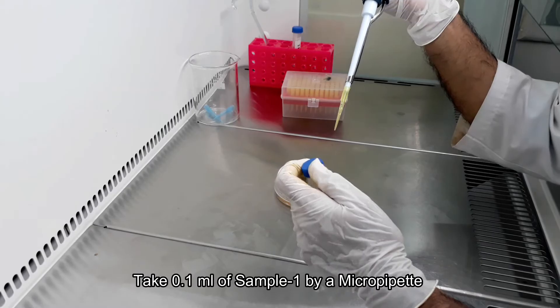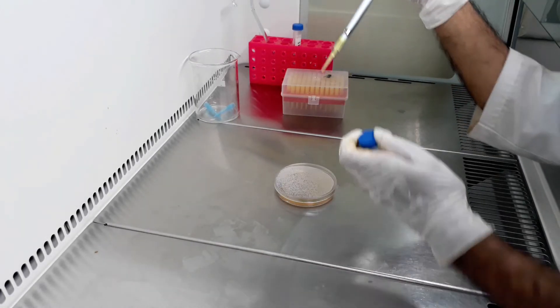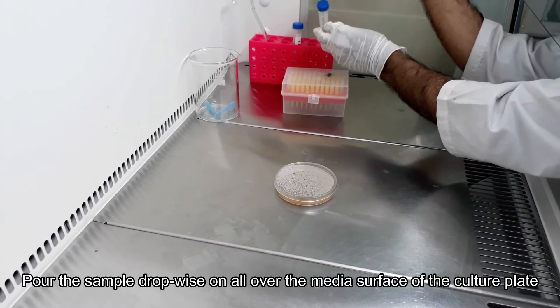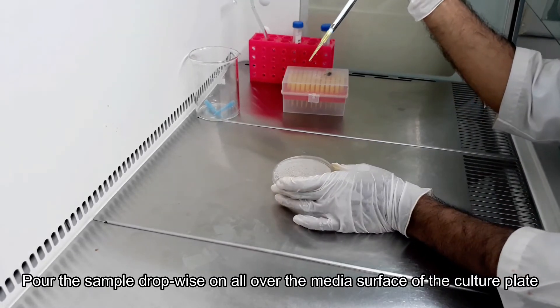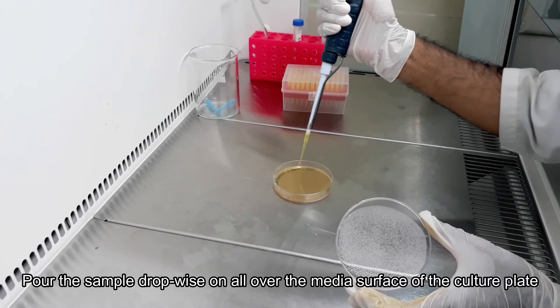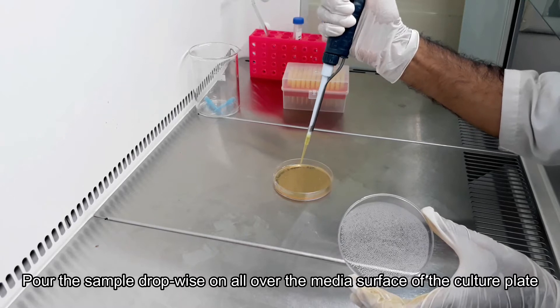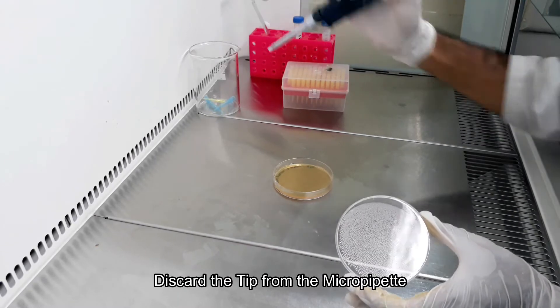Take 0.1 milliliters of sample one using a micro pipette and pour it drop-wise on the surface of the agar culture media plate. Discard the tips from the micro pipette.